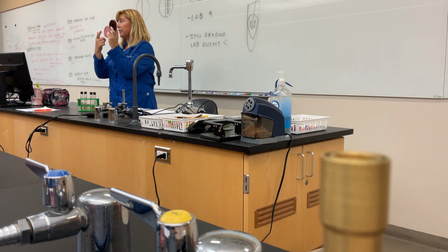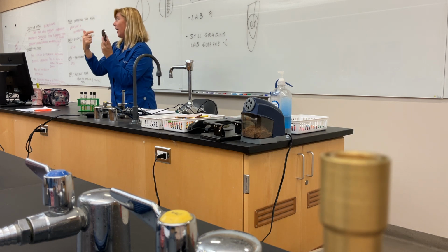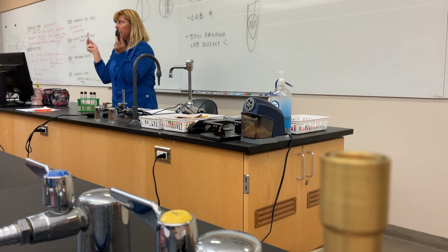So let's say that bacteria is inhibited on this one and I just streaked it. I'll take that inhibition to the next plate and you won't grow when you should. So you'll have to flame sterilize between the different media. All right? Everybody got the game plan?